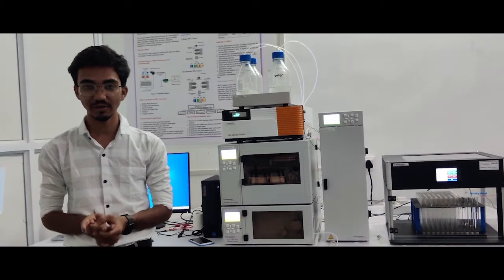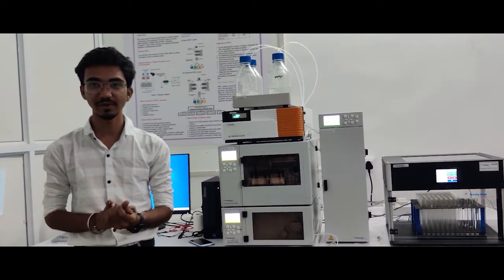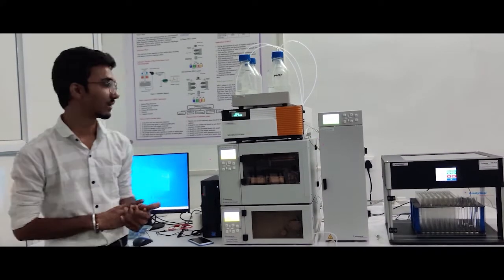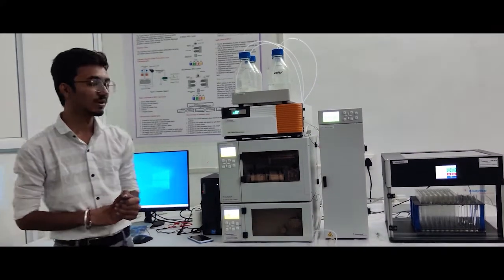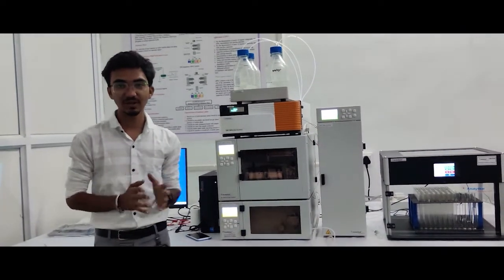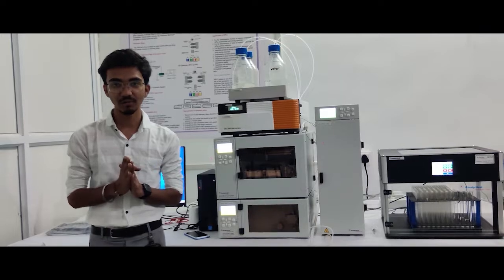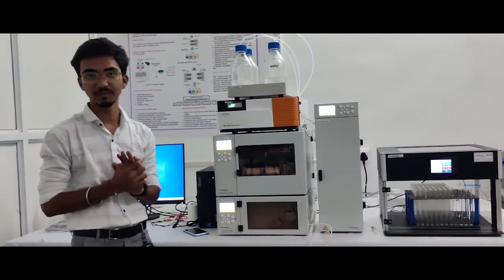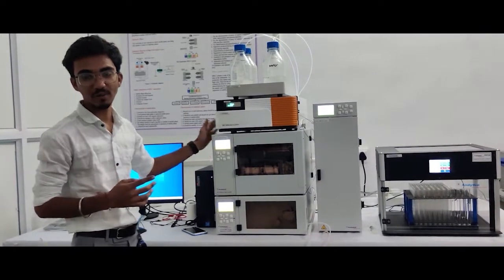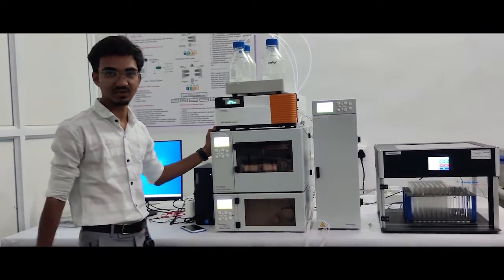You can quantify the sample. Now, we will introduce some of the components of the HPLC instrument.